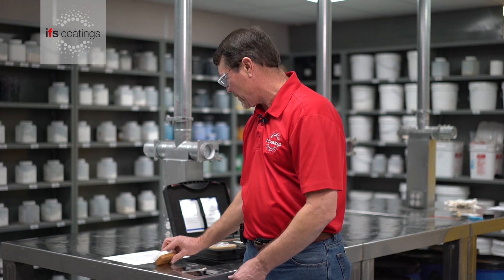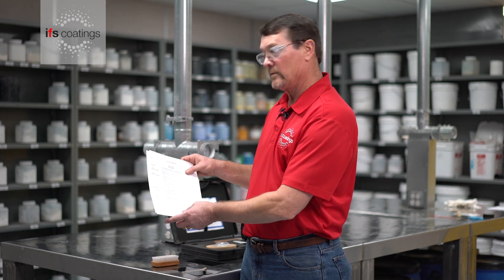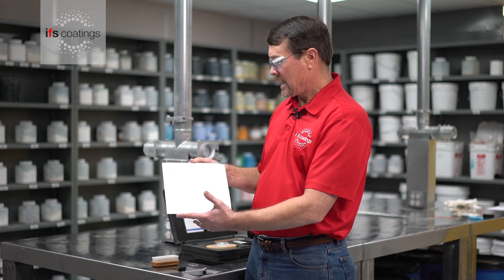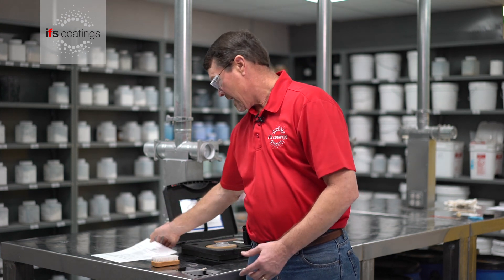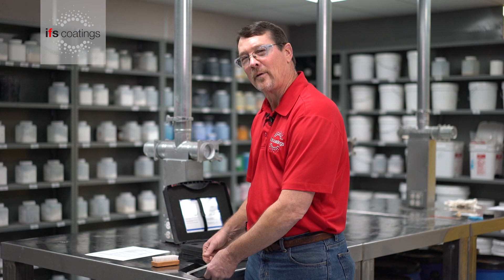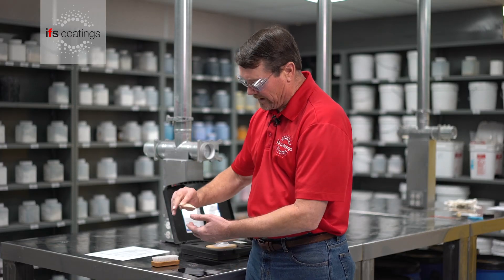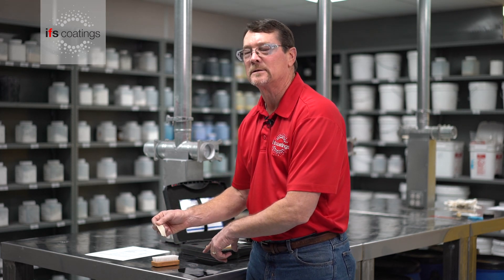One of the things I wanted to point out is that we are using the gloss black, which is a very high gloss, high DOI type finish and a very good looking product. We want to make sure we get a good result, otherwise we may have to go back and see where our problems are. In this case we'll go ahead and rip the tape off, then look at the back of it to make sure we don't see any of these crosshatches coming off.